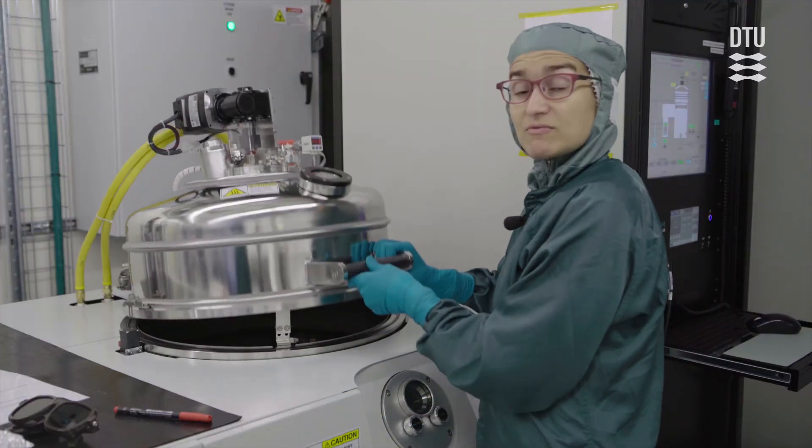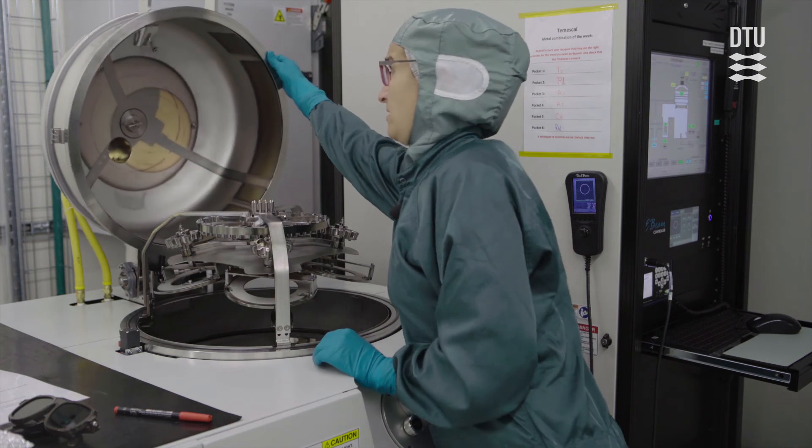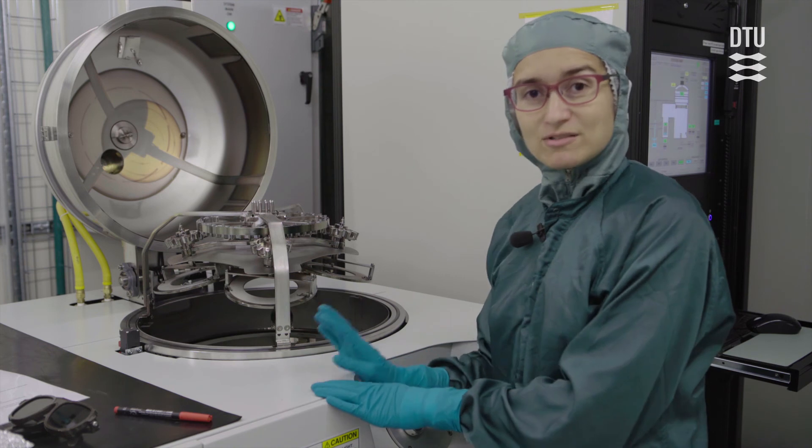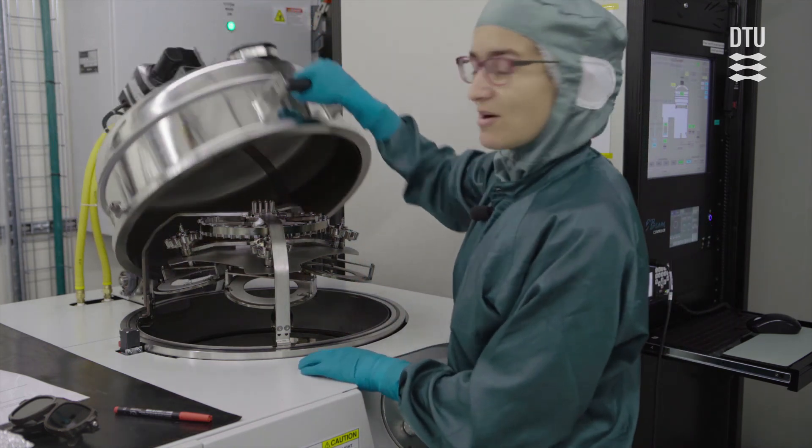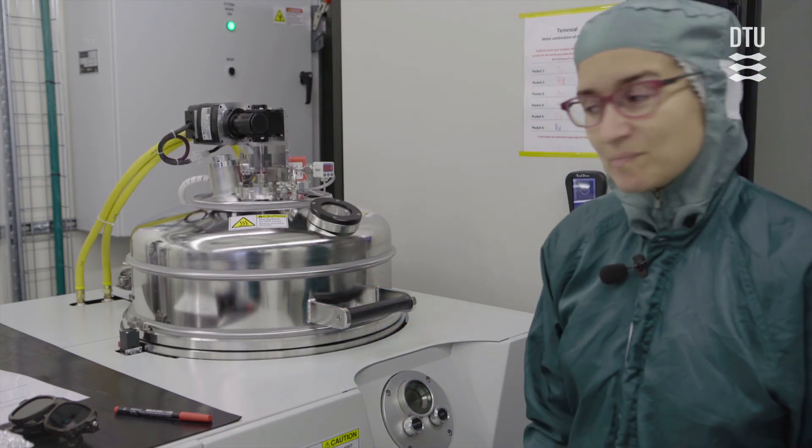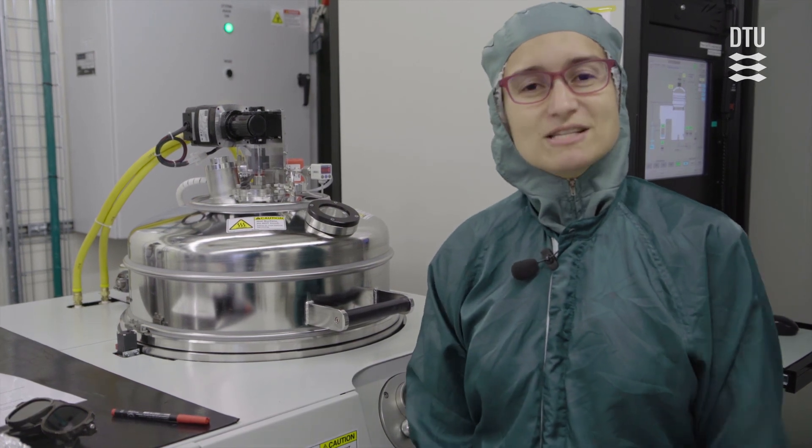So once the system is vented after the deposition, you can just open the load lock, take out your samples, and remember to pump down the system once you're done. Close it up again of course and start pumping in the auto menu. And also please remember to fill out the process log and the load lock.